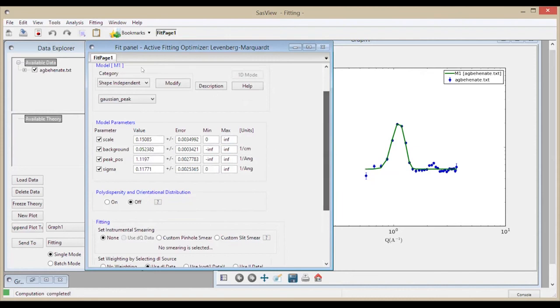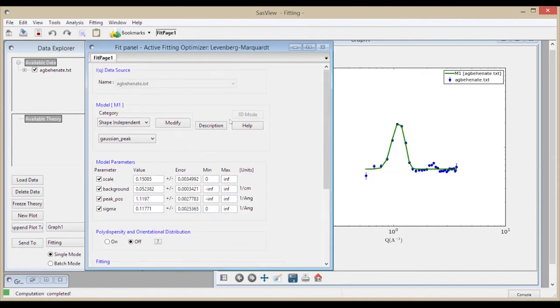This simple model did not contain only one peak, but we can develop this model so that it would contain 2 peaks and fit them simultaneously. We don't need to deal with this now. This was just a demonstration of a very simple fit using this software.